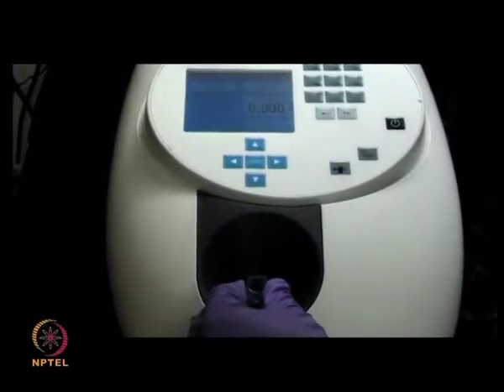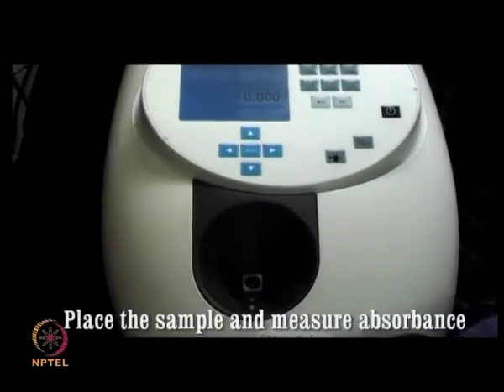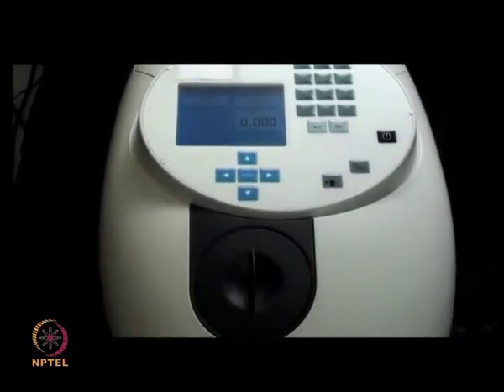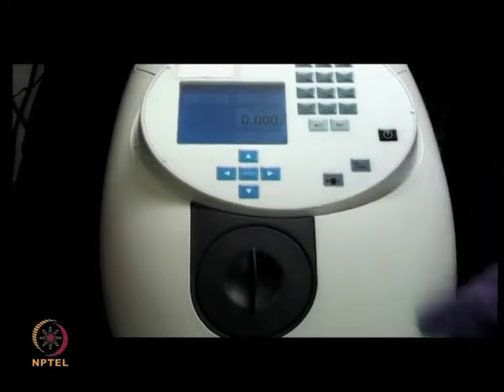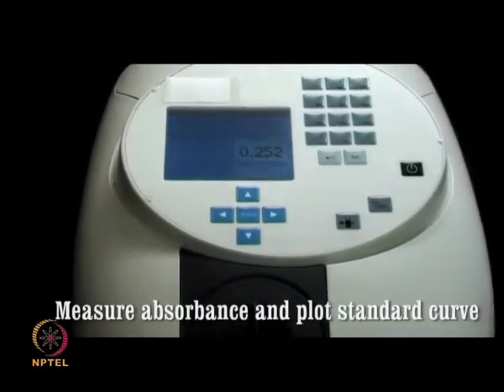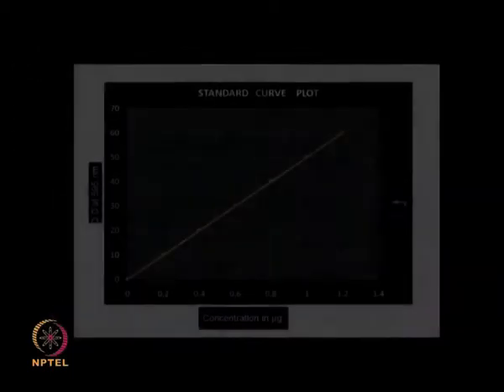Then measure the absorbance of all the standard protein samples of known concentrations, followed by the unknown sample. Protein concentration of the unknown can be determined from the standard curve based on the absorbance value obtained.